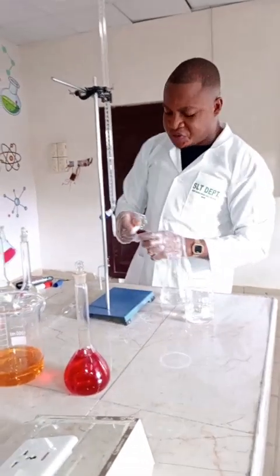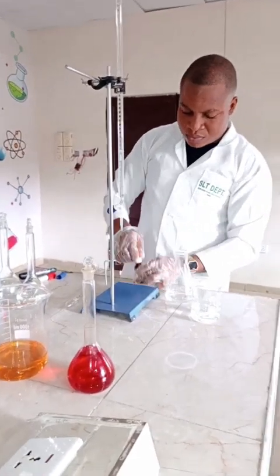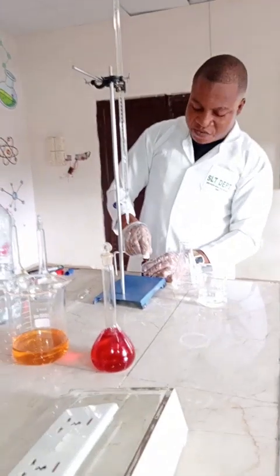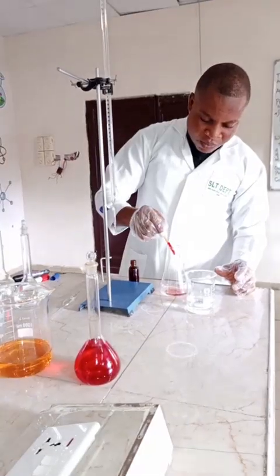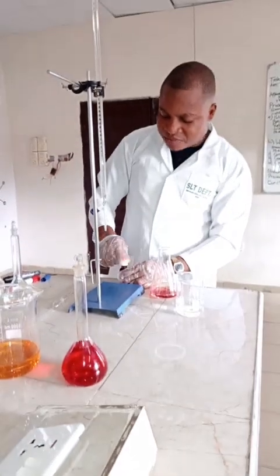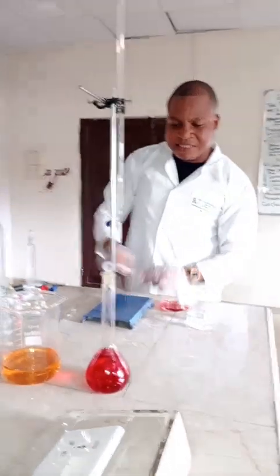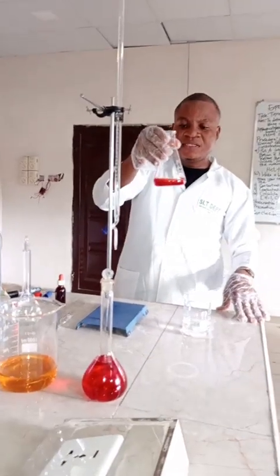Now I'm going to introduce two drops of the indicator material. 1, and this is 2 of my indicator, and this is our starting point. Please note this coloration. This is our starting point.